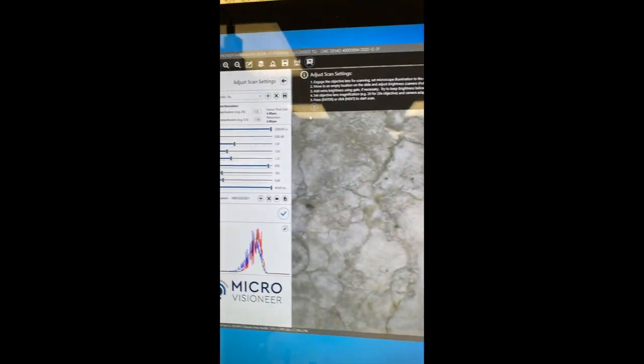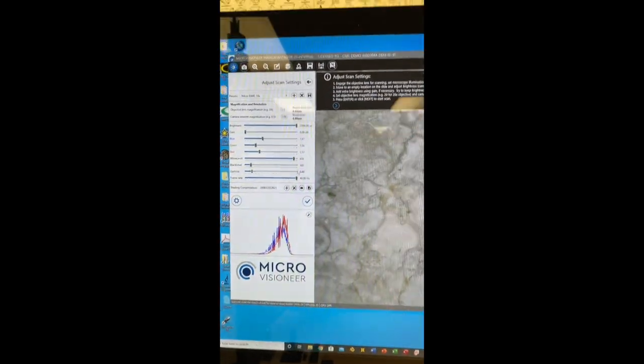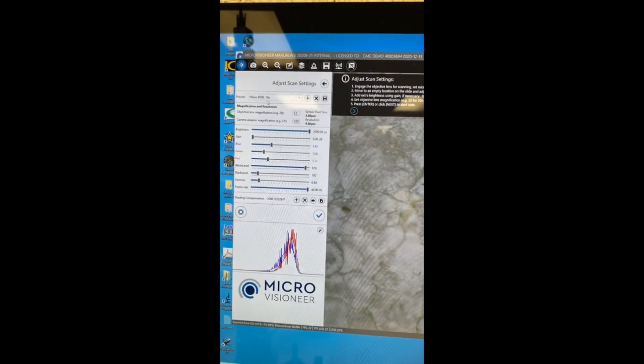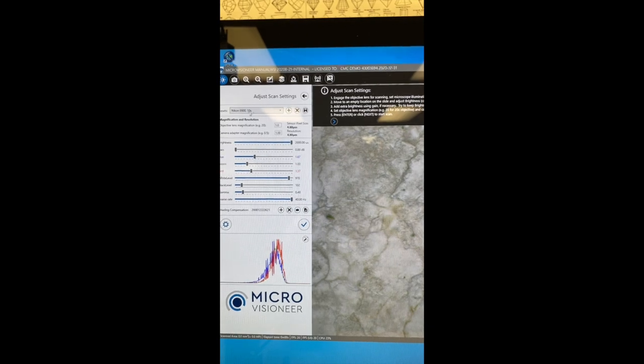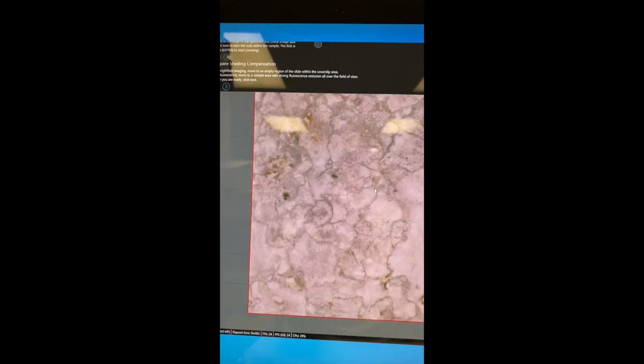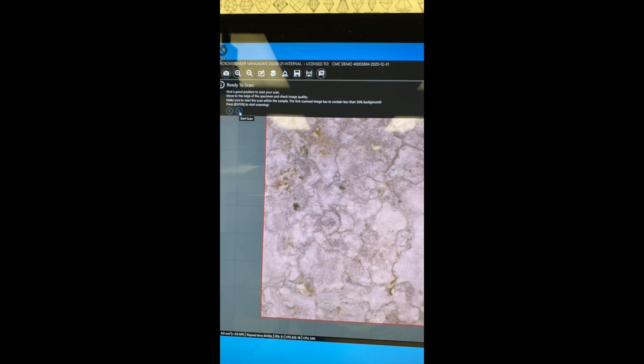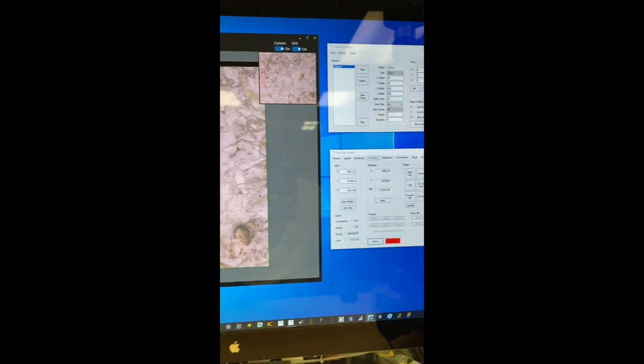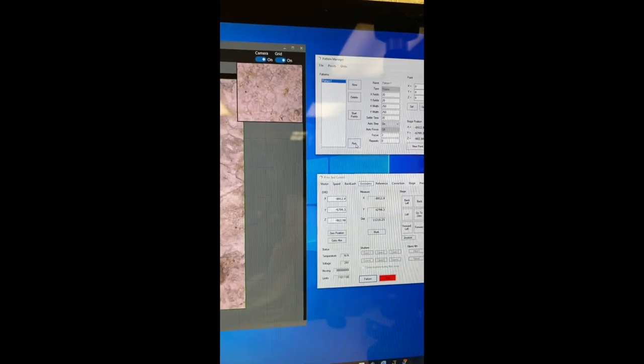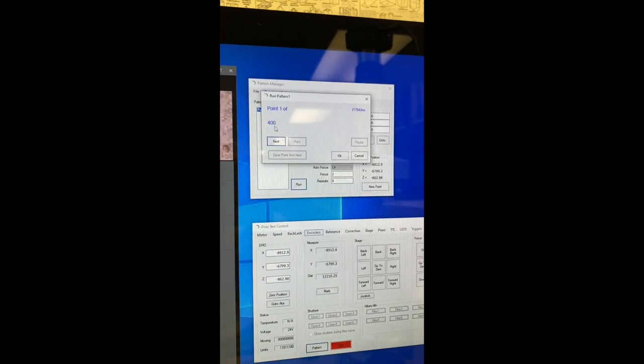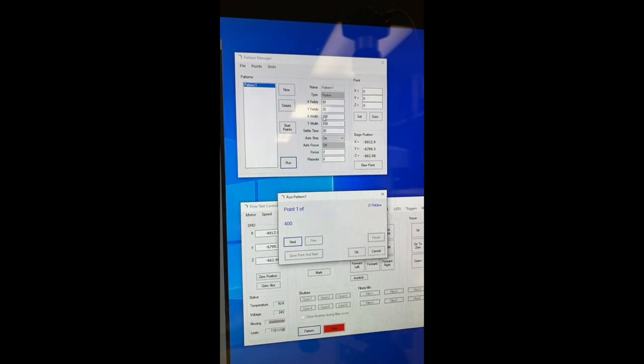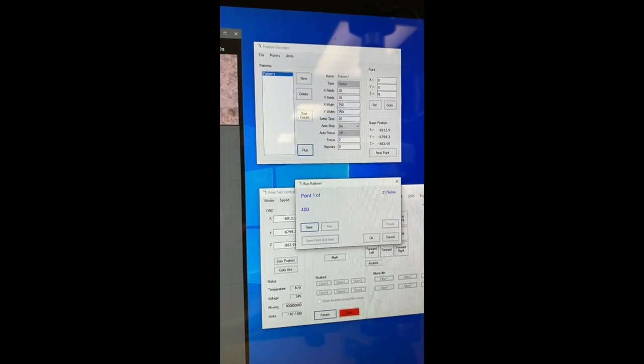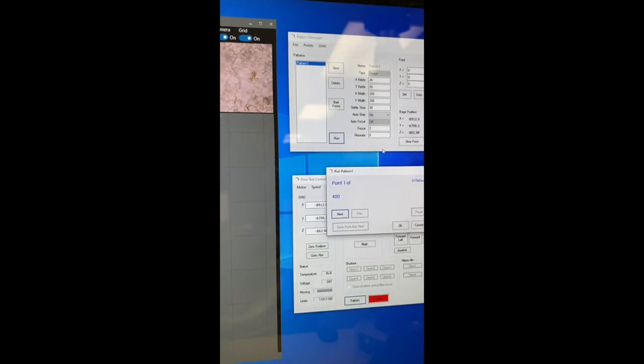Once you open the Microvisioneer manual WSI software with your preset which you adjust at 10x magnification, when you go to start scan, ready to scan, you start scan, you say run. I have chosen 400 points, 20 by 20, with 250 steps in each direction.